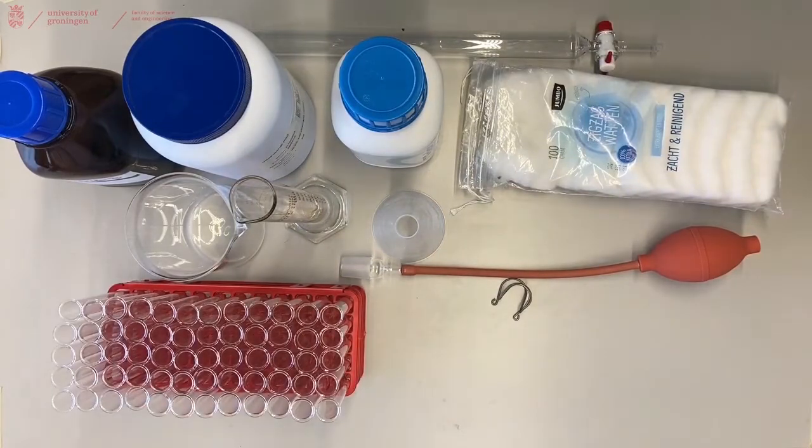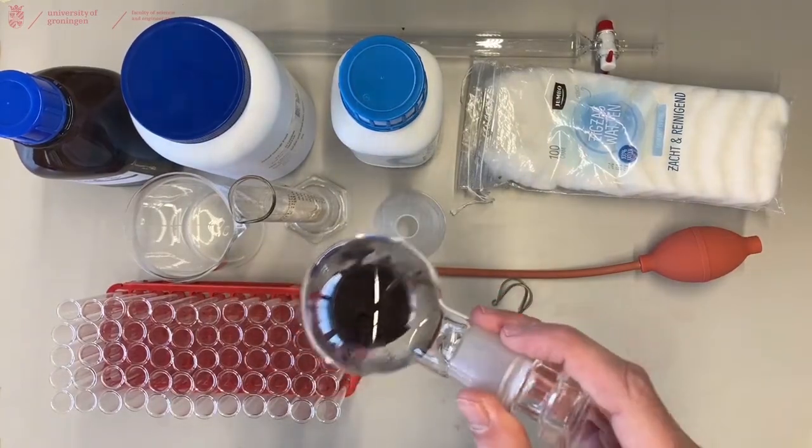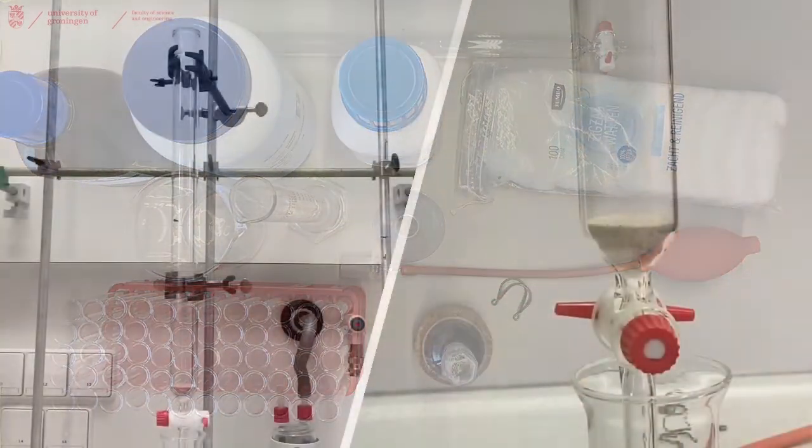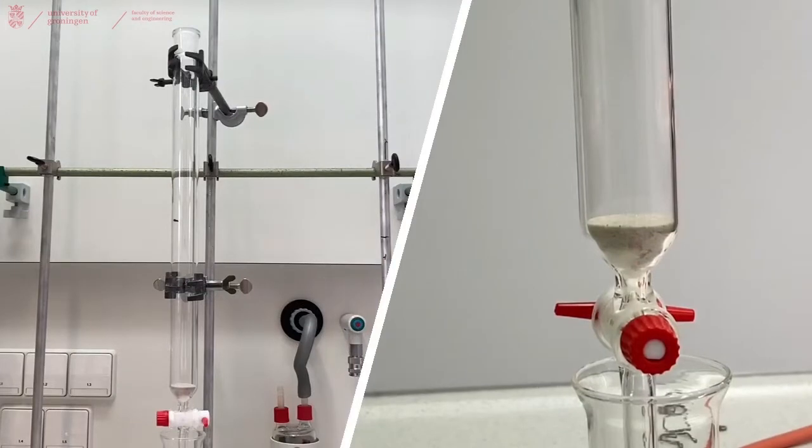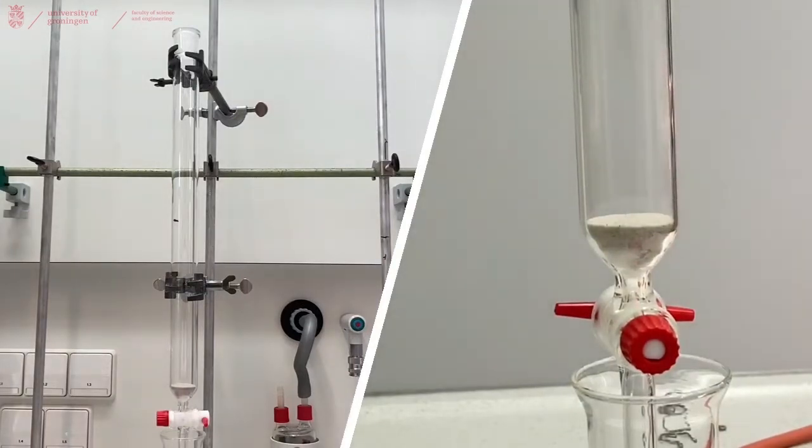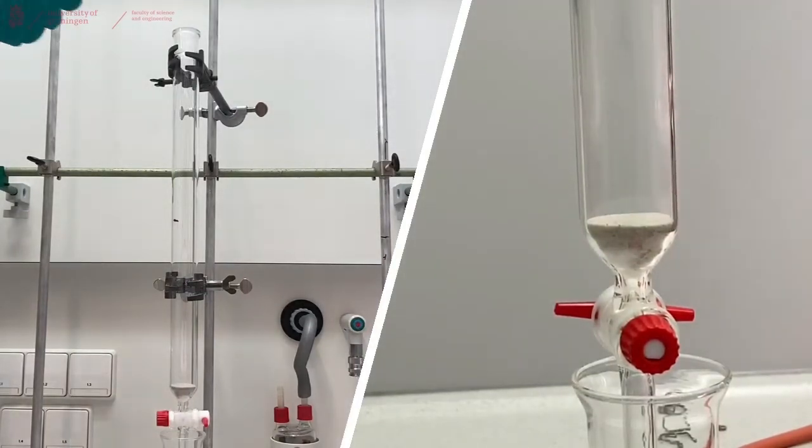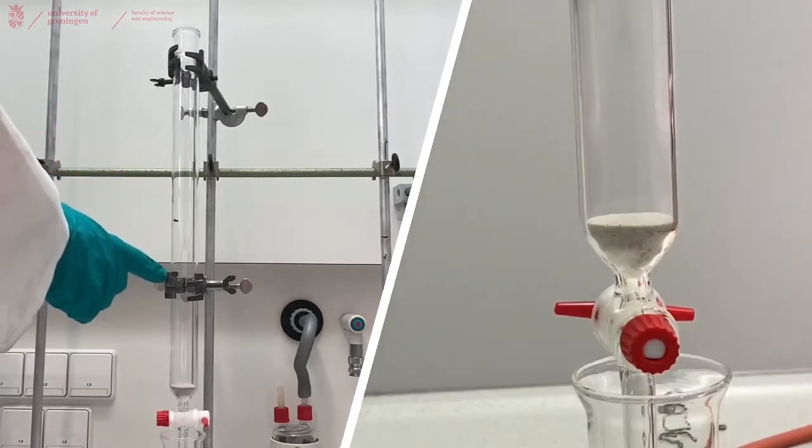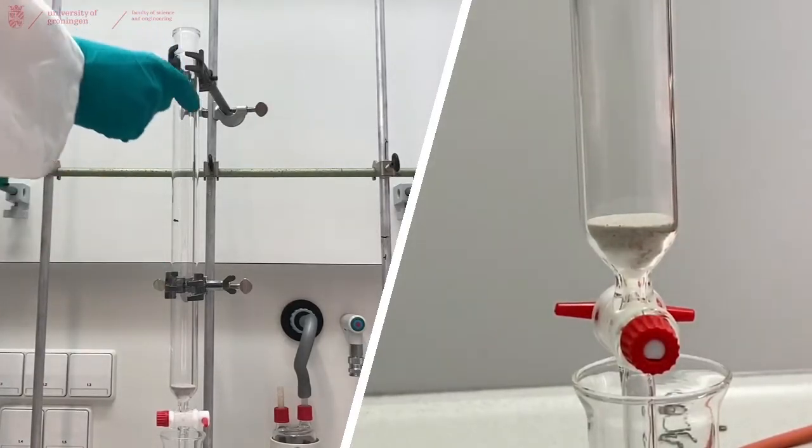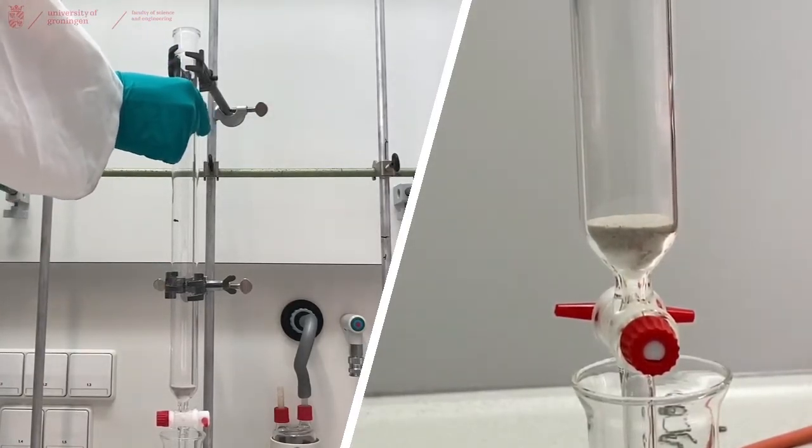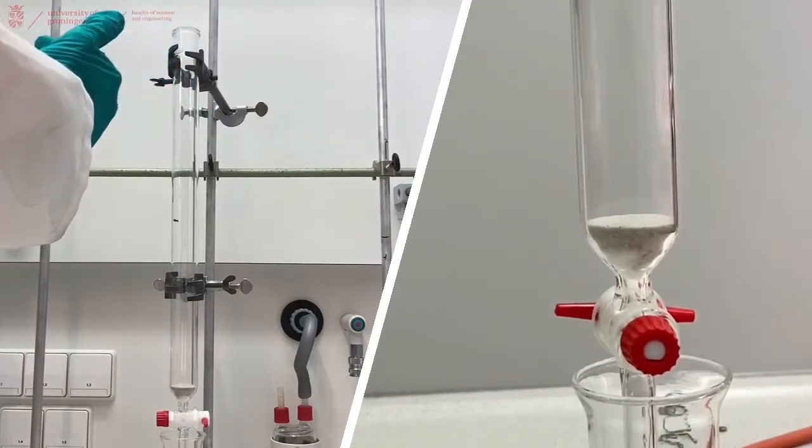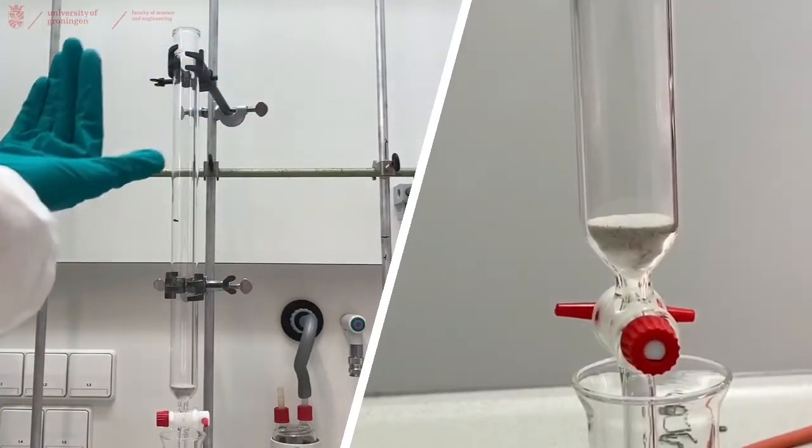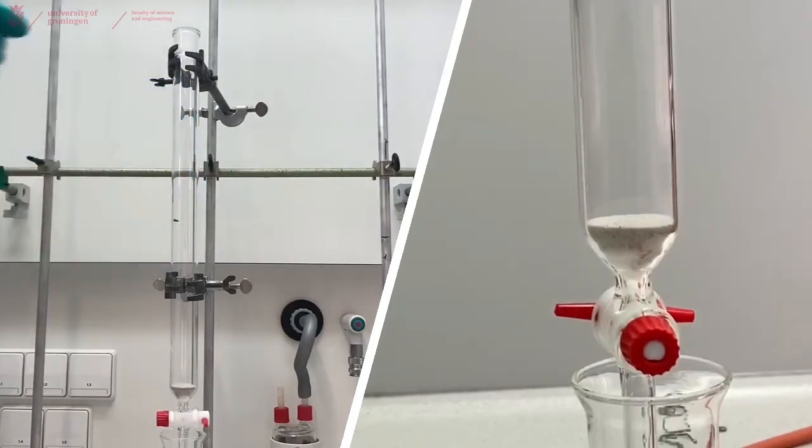And of course, you will need your crude product which you want to column. We already placed the column in our fume hood in this shot, and we placed it with two clamps: one on the top and one somewhere in the middle. Make sure that these clamps hold the column tightly so it can't go anywhere and it is not tilted to any of the sides, backwards or forwards, to have a level flow through your column.